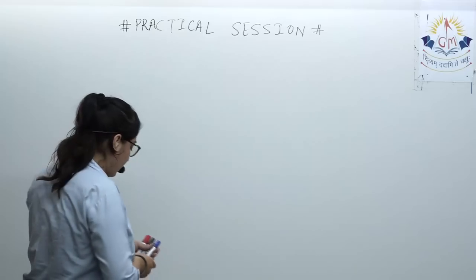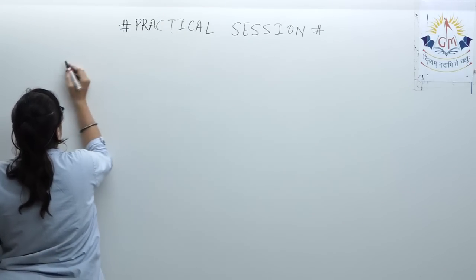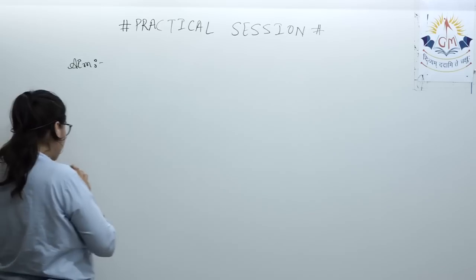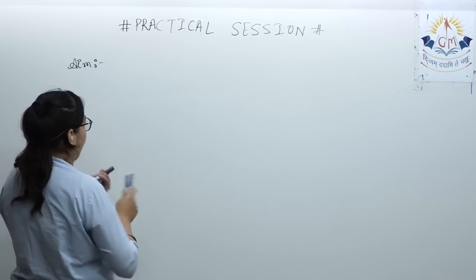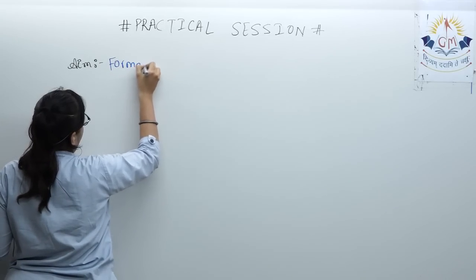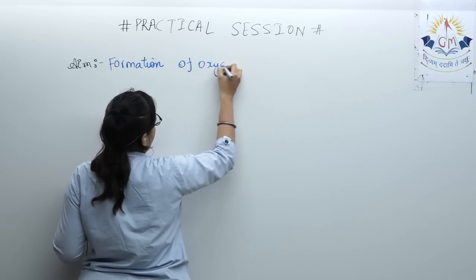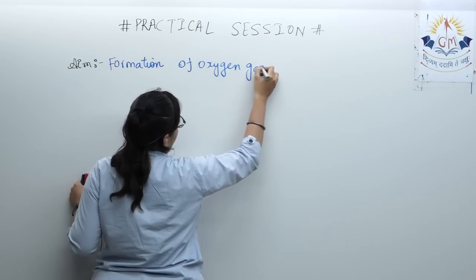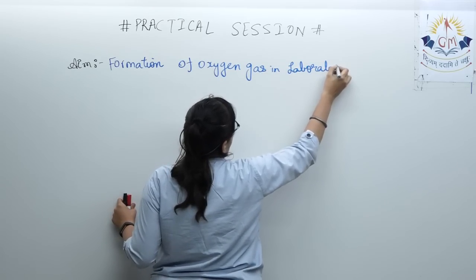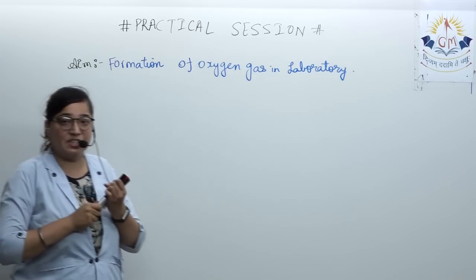So, aim is formation of oxygen gas in laboratory. Next, materials needed.